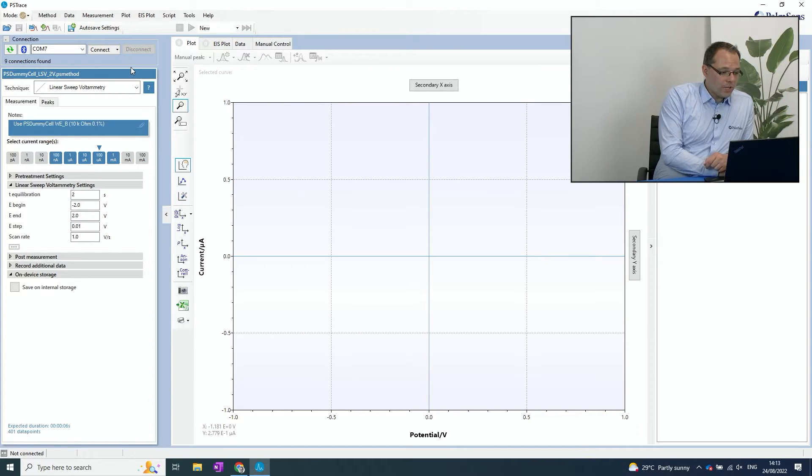So to connect the instrument via Bluetooth, I'm pressing this Bluetooth button and then the software searches for Bluetooth instruments. If you don't see the Bluetooth button, just go to Tools, General Settings and switch on the Bluetooth.